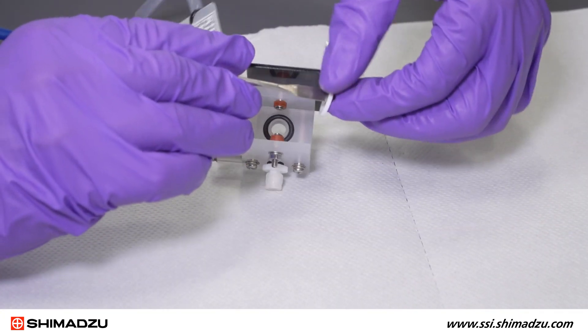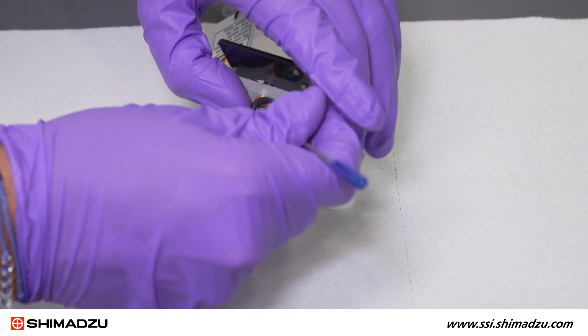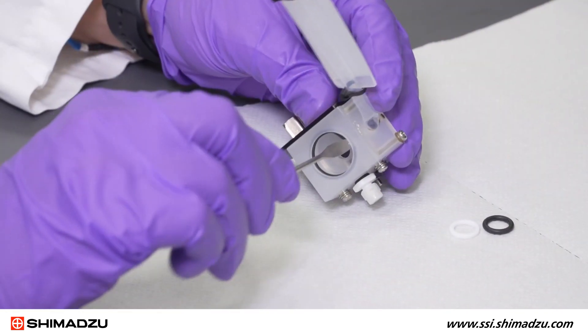A sharp or pointed instrument will help with removing the O-rings. Take extra precaution not to score or damage the Teflon.